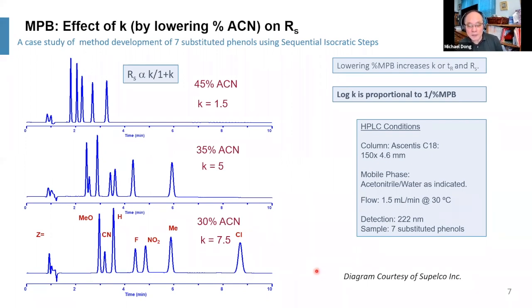But in real pharmaceutical development, we always have a single API peak plus a lot of process impurity and degradation product peaks, which have not been defined if you start from scratch, right? If you start from early development, you don't really know what they are. And we always, without exception, use a gradient in those very critical methods, right? But here is an example of an isocratic separation method development.